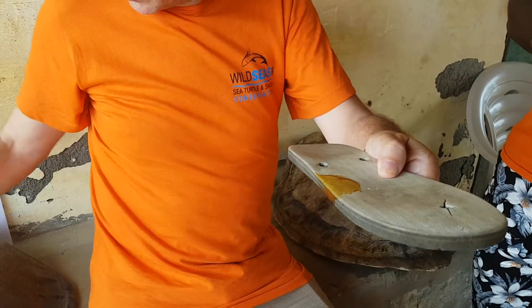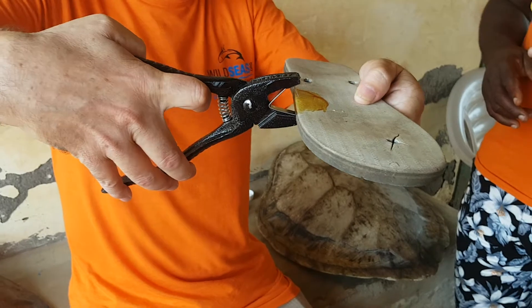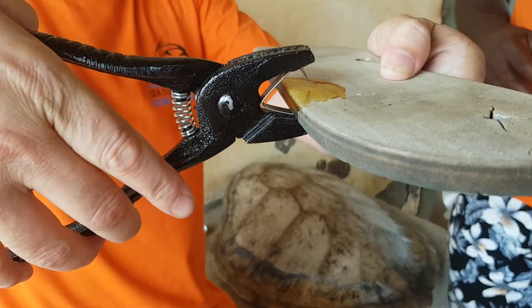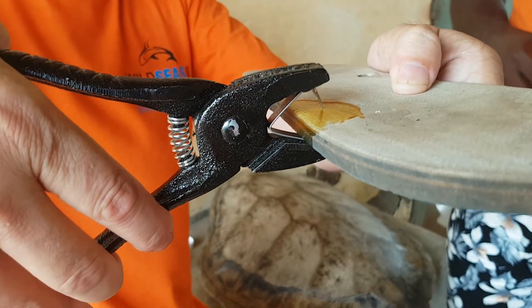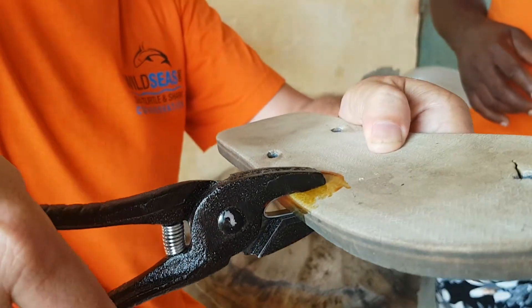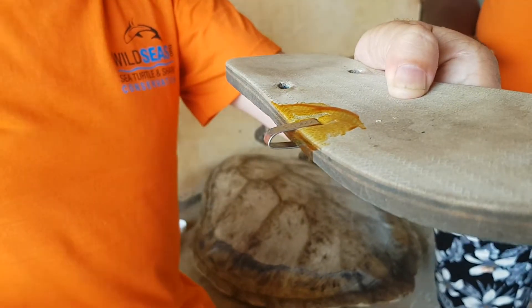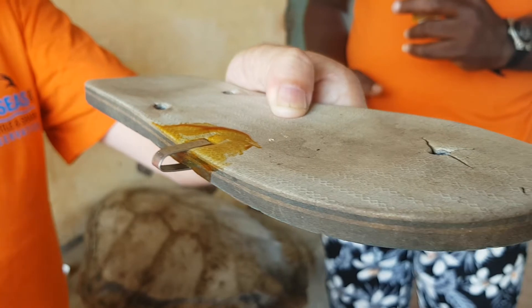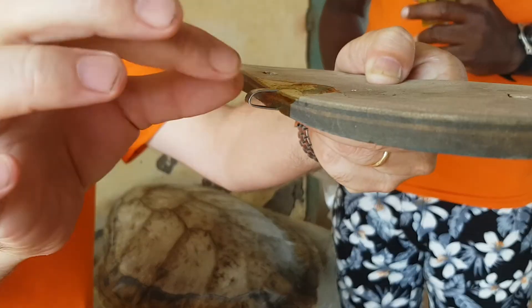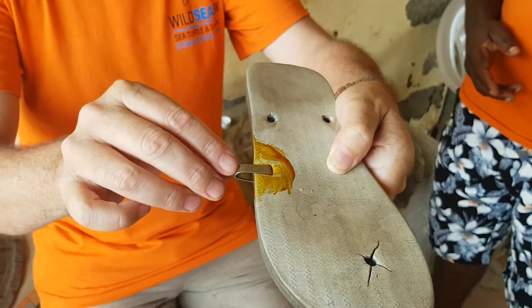Then, in as swift a movement as possible, we take the flipper and place the tag leaving a gap of approximately 8mm at the trailing edge of the tag, and we press down sharply and swiftly. We then release and we will see that the tag is now applied to the flipper in a secure manner.